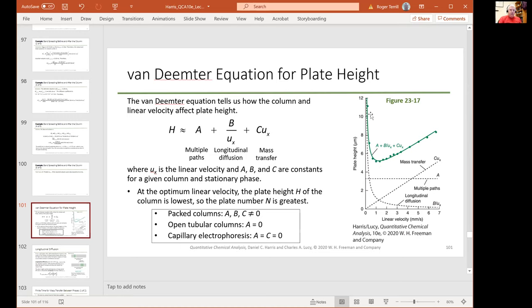So this means that for a given solute, for a given analyte, like let's say caffeine, you can go too slow. If you take a long time, if you pump it really slowly, the bands will not come out optimally sharp. Does that make sense? Ultimately, if you extend that idea, it'll take a year to elute the peak, and it's just not going to look right. It's just going to look like crap.